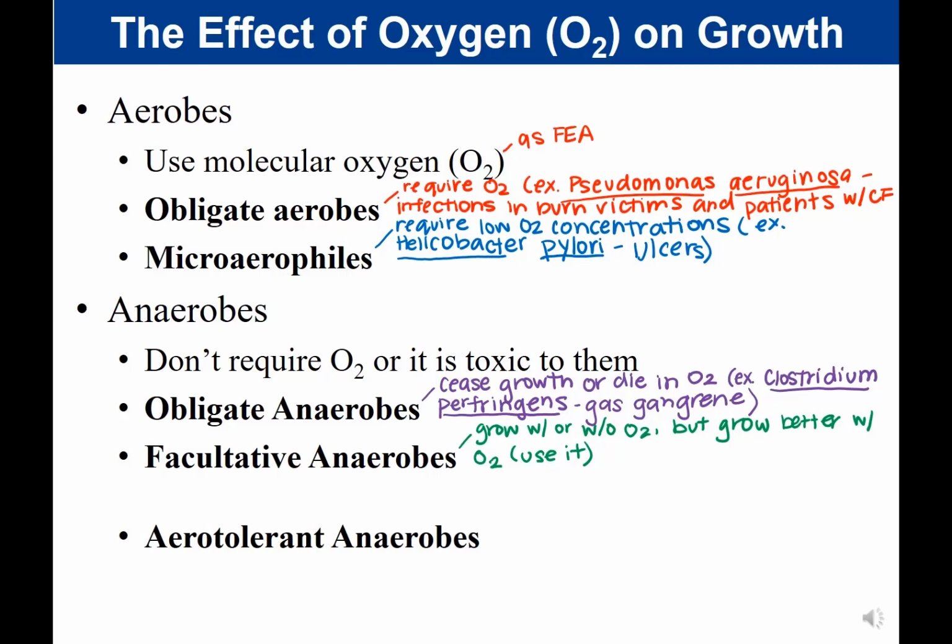And so an example of this that you've seen would be when we did our standard plate count. Remember that the purpose of our standard plate count was to isolate individual colonies of bacteria and determine the titer, so the concentration of bacteria in the solution. When we did this, we took our E. coli and we mixed it with the agar and then poured our plates.